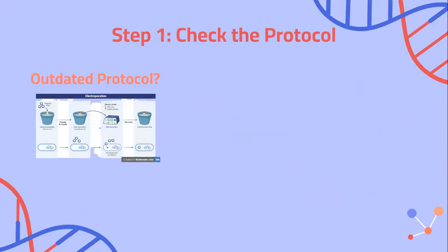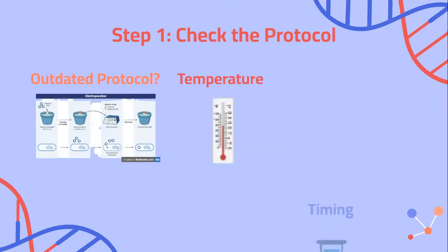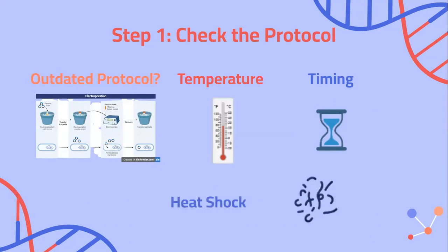It's also important to follow the protocol, particularly the timing and temperature of some procedures. While timing and temperature do not have to be strictly adhered to at all times, such as during incubation, it must be followed during vital aspects of the procedure, such as heat shocking. Prolonged exposure to heat or exposure to higher temperatures can have a drastic impact on the experiment as the plasmids can denature. Prolonged exposure to heat or high temperatures can cause the bonds within the plasmid molecule to break down, inhibiting the transformation process. Timing between transformations and plating also impacts the transformation efficiency. Depending on the strain and plasmid, an increase in the interval between transformation and plating decreases the transformation efficiency significantly.